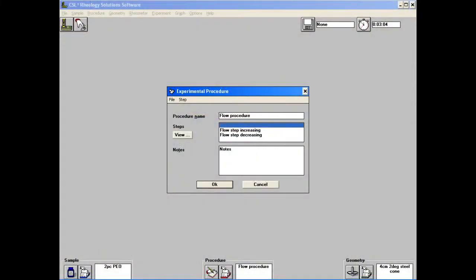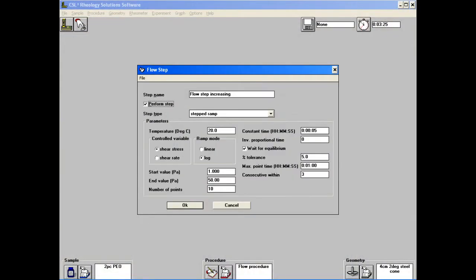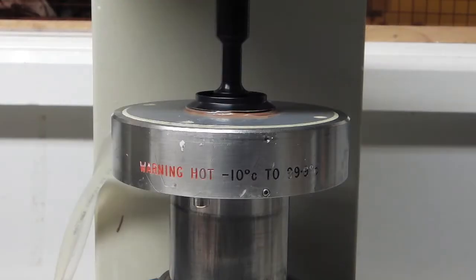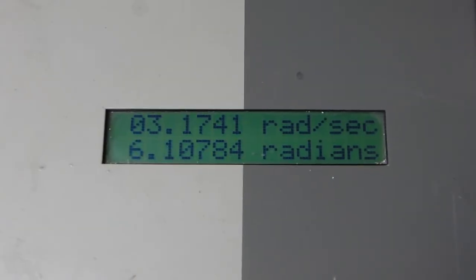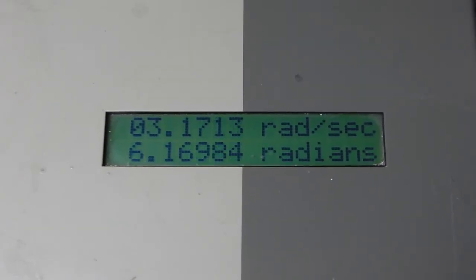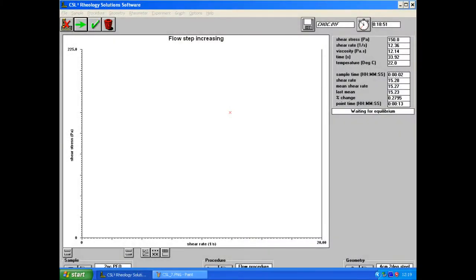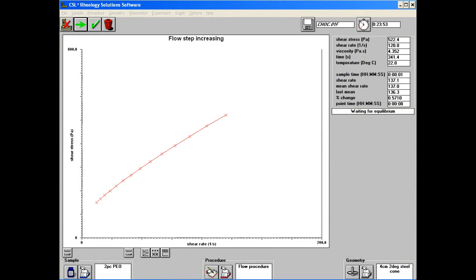We can now use the software to set the flow procedures. Typically, this consists of a first phase in which the torque applied to the cone is gradually increased, and a second phase during which it is decreased. We can set both constant and varying temperatures throughout. During the measurement, the LCD screen displays the rate at which the geometry is turning, and a live graph of the data is produced by the program.